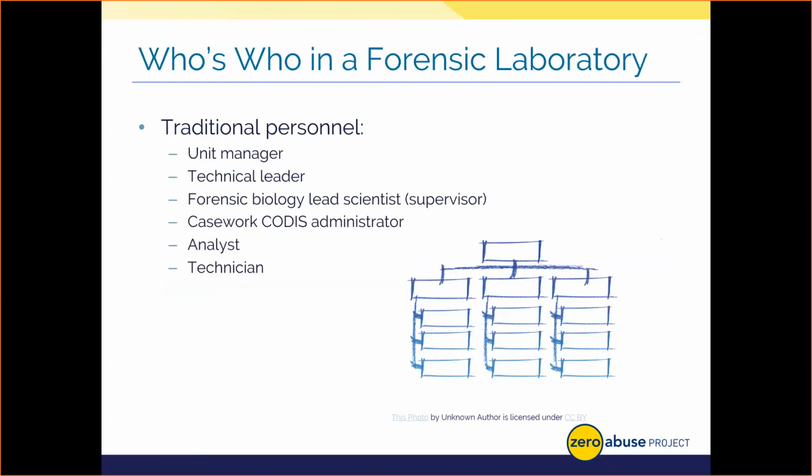You know, we examine evidence, process samples, and analyze results. We can't change policies on what can be submitted. And if we deviate from a testing standard operating procedure, we have to get permission from the technical leader, who's the scientific brains of the operation. They maintain the authority over all testing methods and procedures.